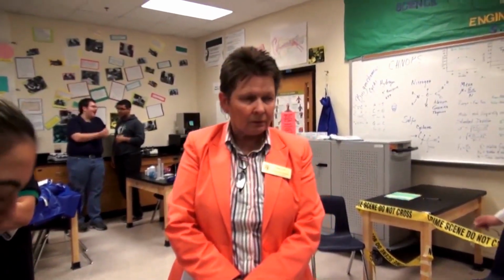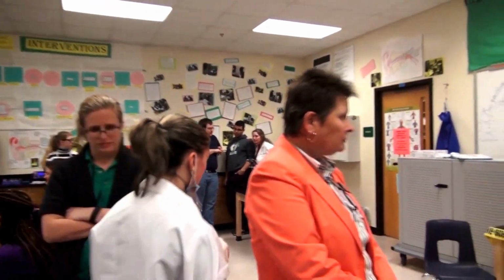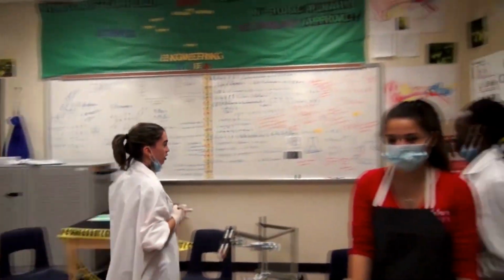So how are you counting your colonies? We have a colony counter that we also use for our science fair project, where we did something very similar. And one thing that we really loved about this was that we could calculate the generation time of it. Okay. And we used all of this math over here.